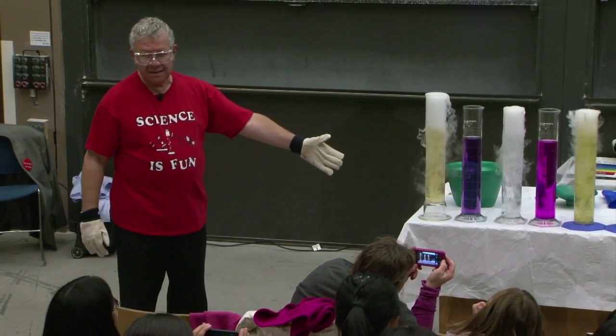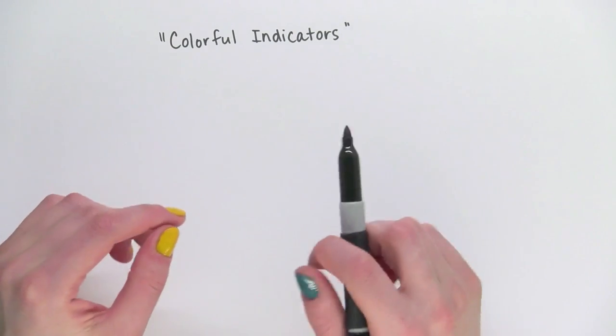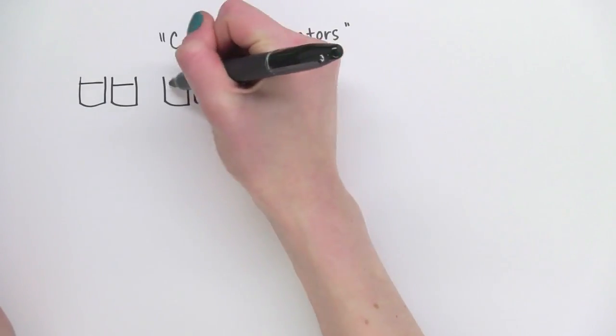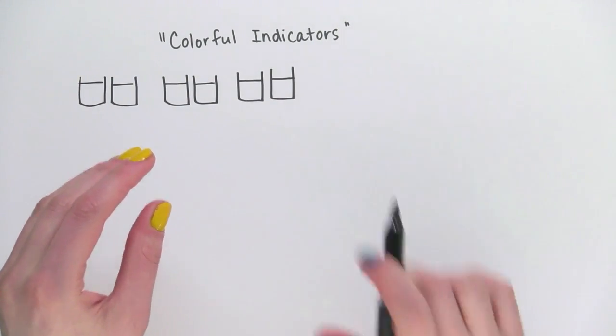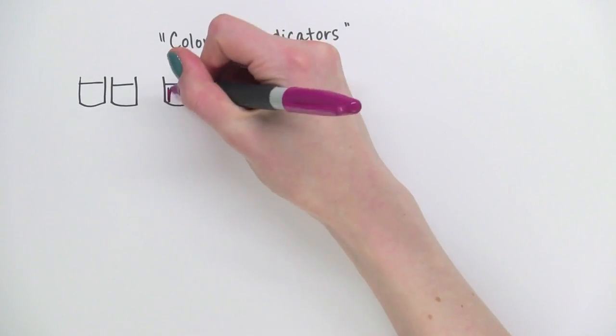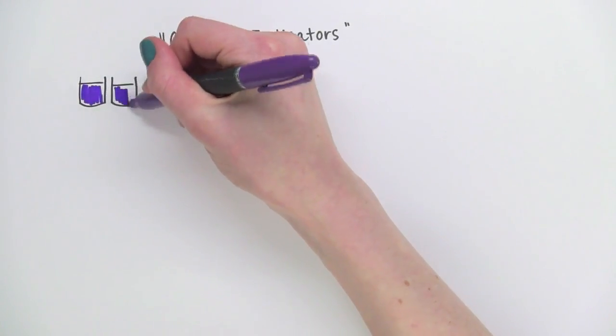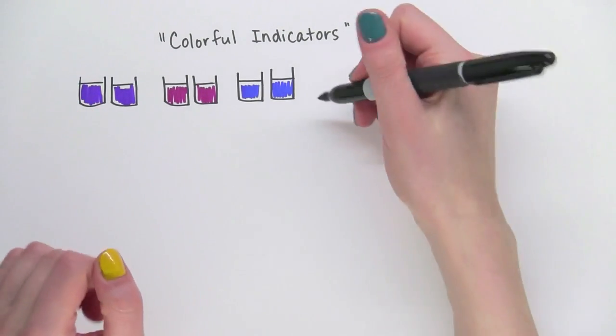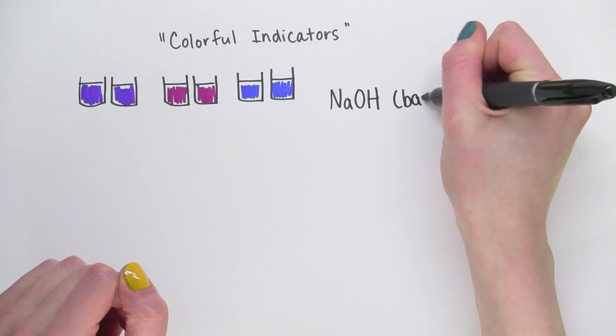So these are dyes that change color when the pH of the liquid changes. So let's break down what's happening in these cylinders. There's six of them. And each set is a different color because there are different acid-base indicators inside them. So this set starts out blue. This one starts out pink. And the final one is purple. And every cylinder contains a few drops of sodium hydroxide, which is a base. NaOH, sodium hydroxide, and it's a base.